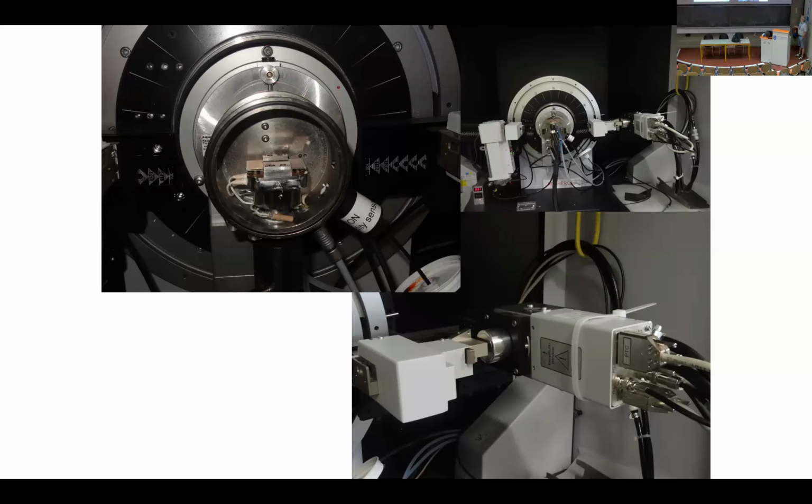At some point there were also monochromators put in the outgoing beam path, using a very crystalline material. It could be graphite, it could be germanium, any kind of material, monocrystalline if possible. That was used.